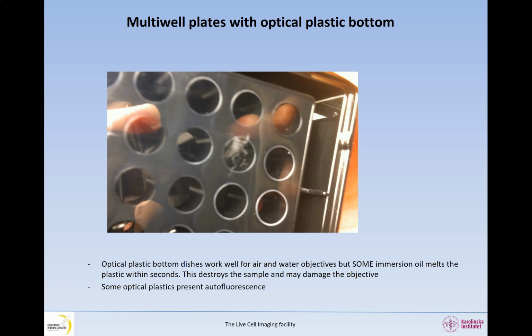So if you have a dim cell, it might drown in the background signal coming from autofluorescence. Thus, you might not be able to see it. Here you can see a multi-well plate with plastic bottom touched by the immersion oil.